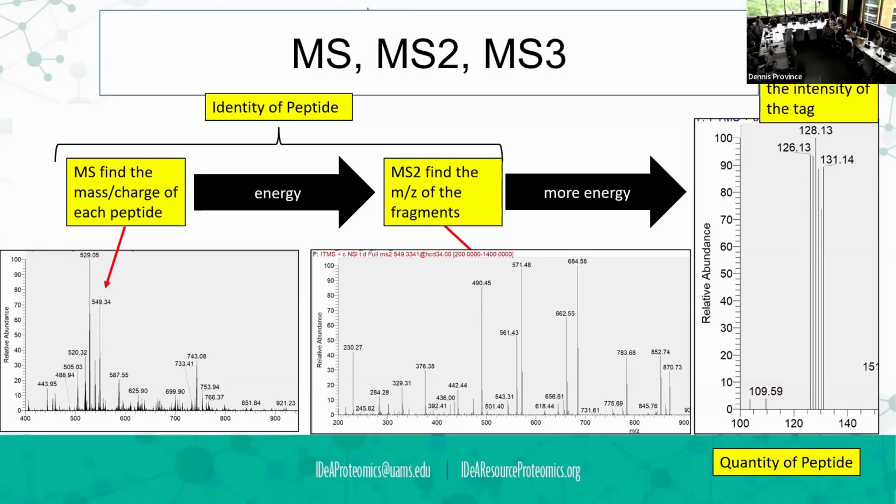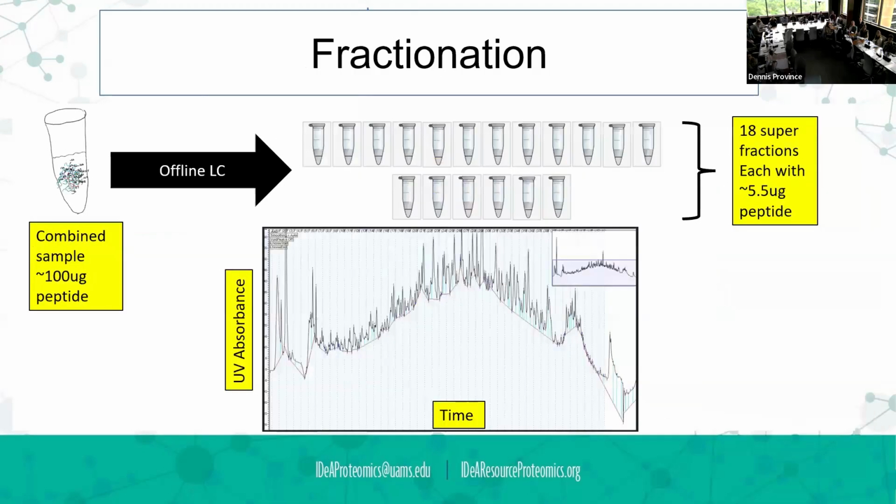And that's a really great question. Without TMT, do you quantitate at the MS1 level? Do you quantitate at the MS2 level? Do you count the number of times that you see that spectra? What do you do? And we could have a whole weekend on that as well.